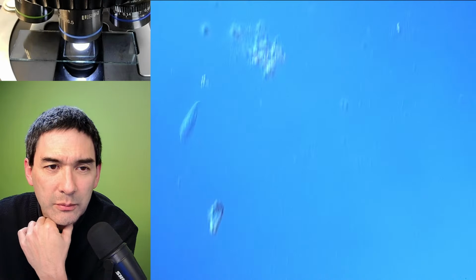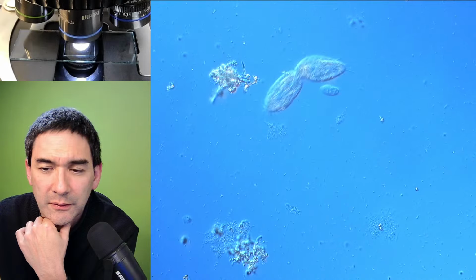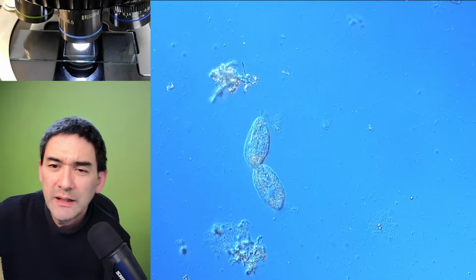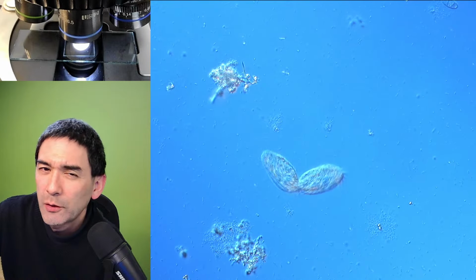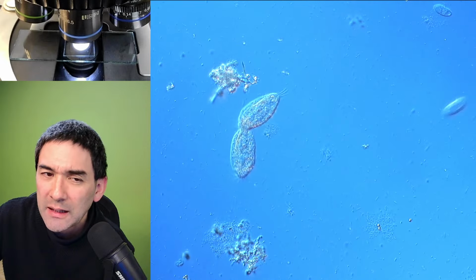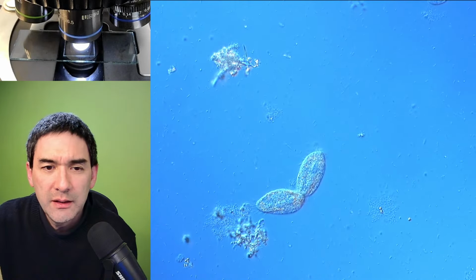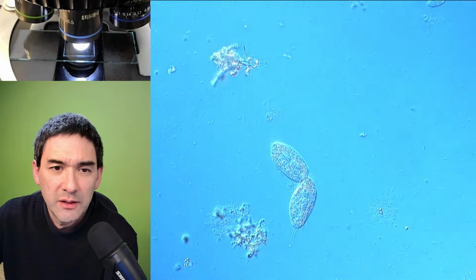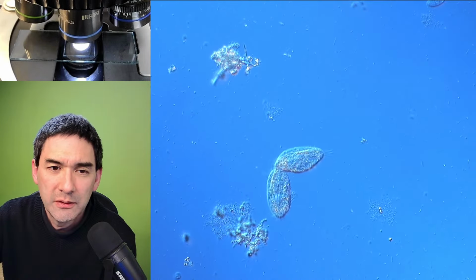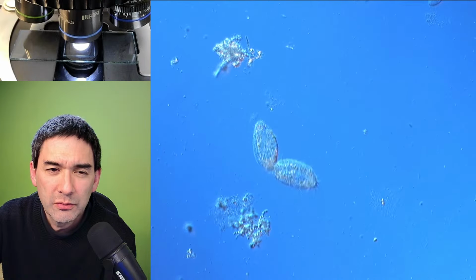Those tiny things that are moving around. And those lacrimaria have very long necks. Sometimes I've seen them retracted; they can retract them, but lacrimaria look very, very distinct. This is actually quite a nice one, I think. But unfortunately, this is still going to take a while. We can follow it along, but I think it might still take some time until it divides. But you can see it becomes a little bit more narrow already here.